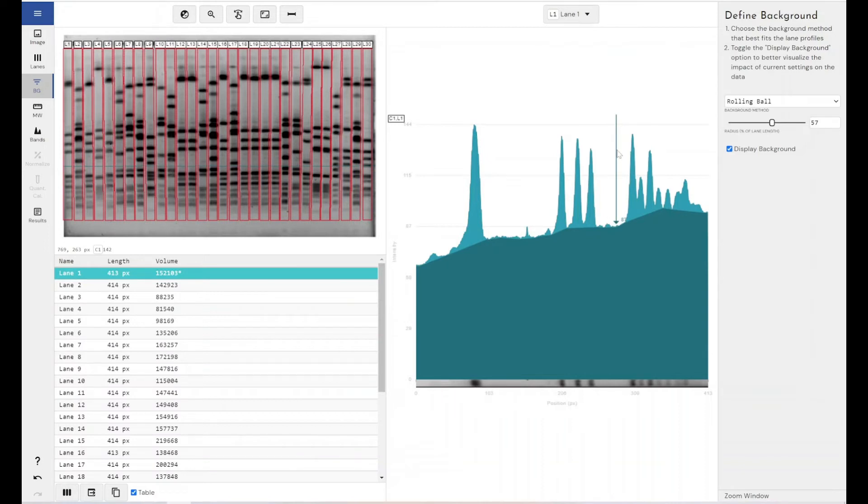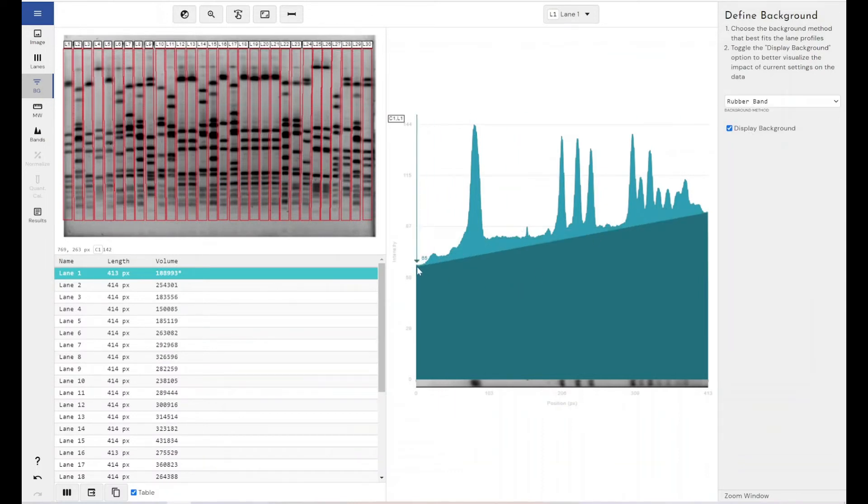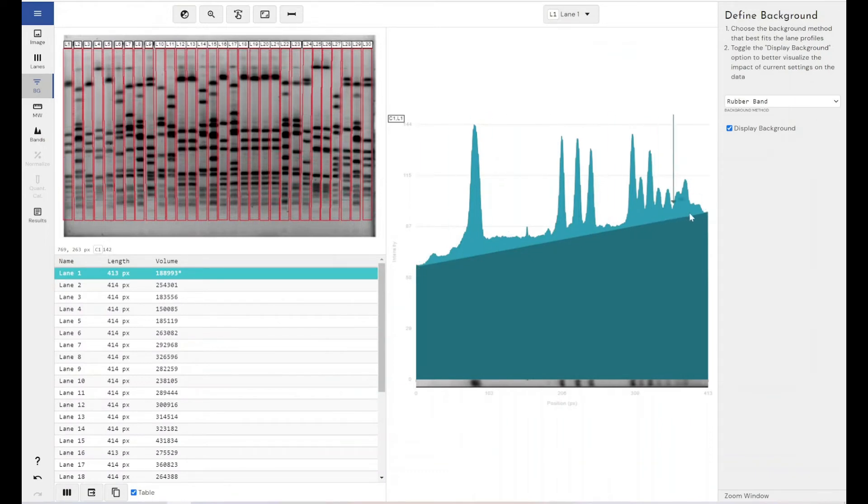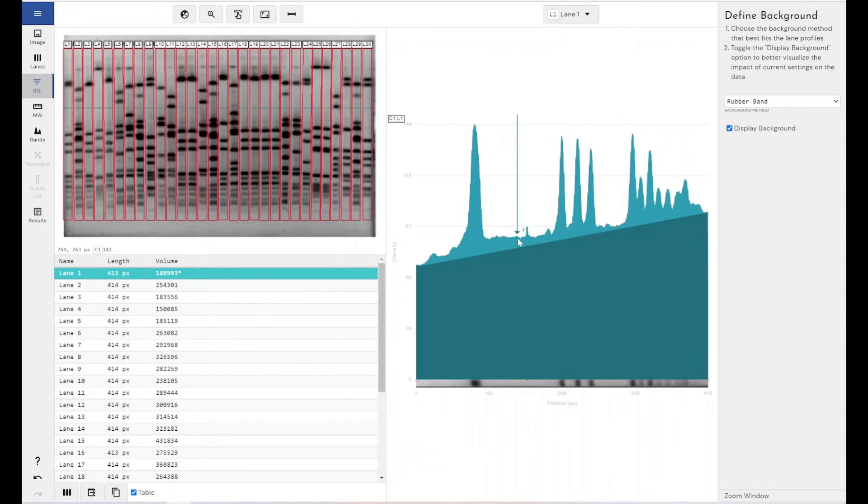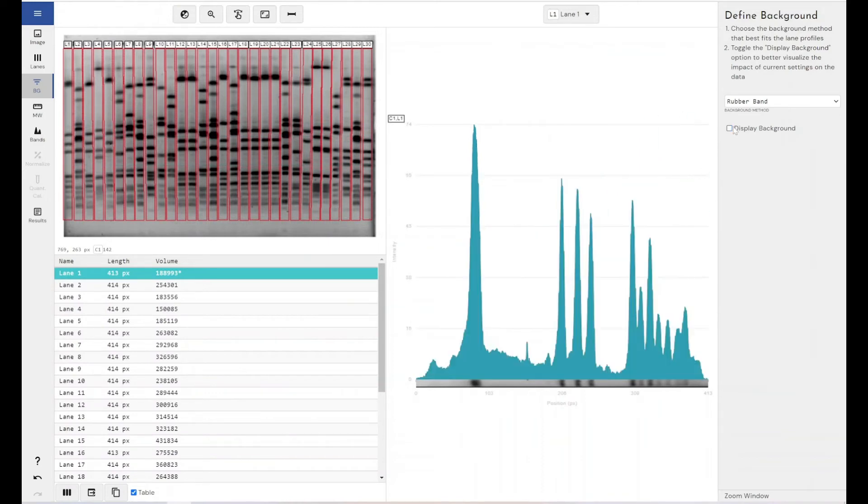Now, if you don't want to use the rolling ball background subtraction method, we have the rubber band method, which just draws a straight line between the start and end point of a profile. But as you can see, this hasn't accounted for quite a lot of the background which is in this image. So it's not as flexible or as adaptable as the rolling ball technique.